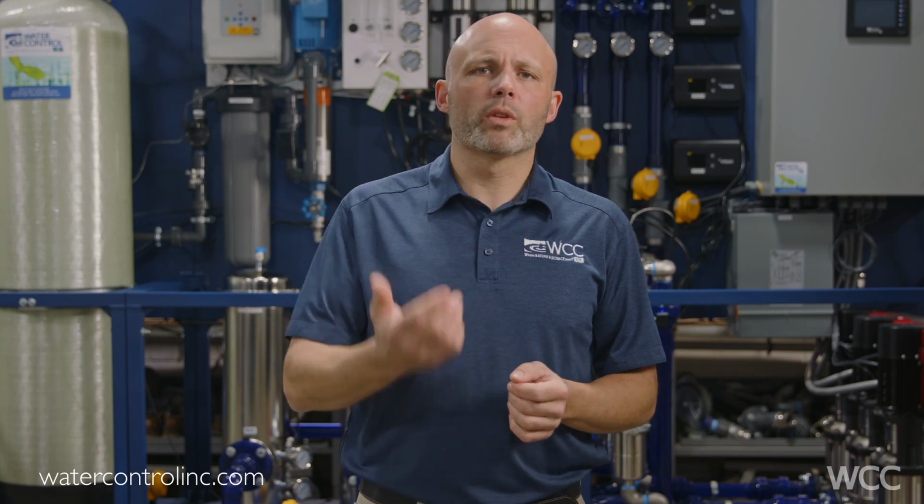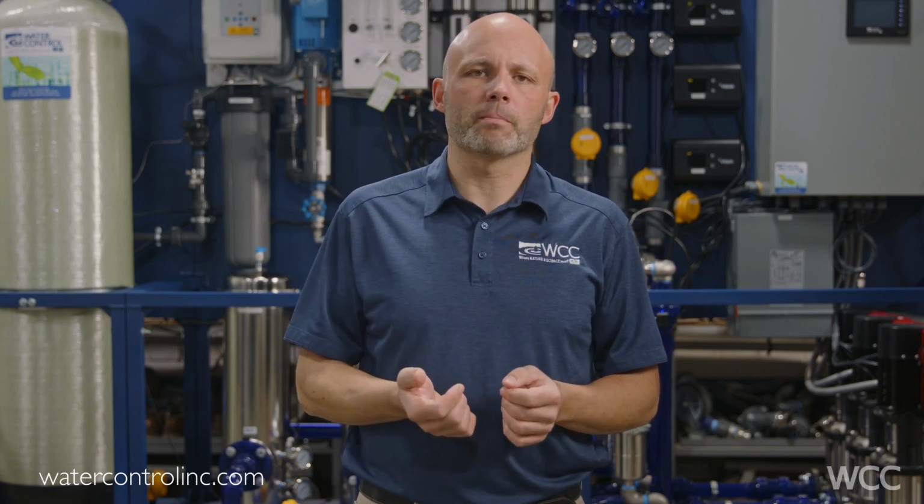In past videos, we've spent quite a bit of time discussing high purity water systems. We've talked all about reverse osmosis and deionization, how it works, what are the critical components to a functioning system, and more. But a topic we've not covered is the different applications for pure water and what associated water quality standards need to be met for those applications.